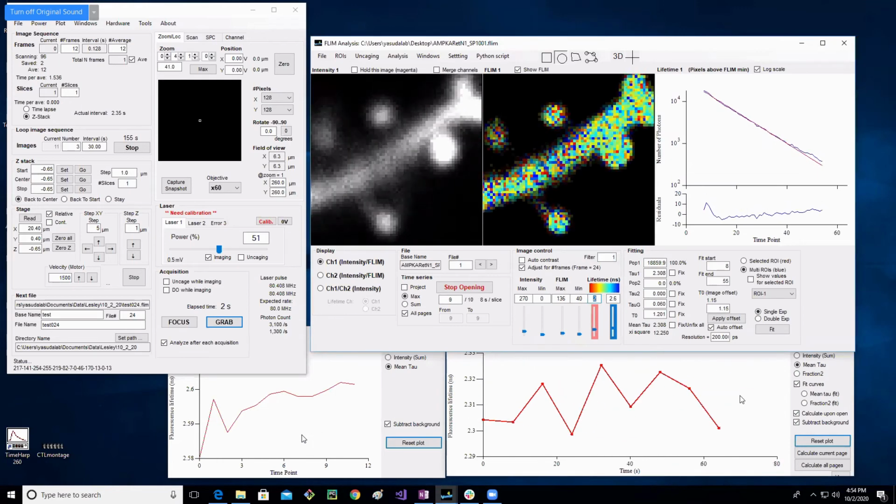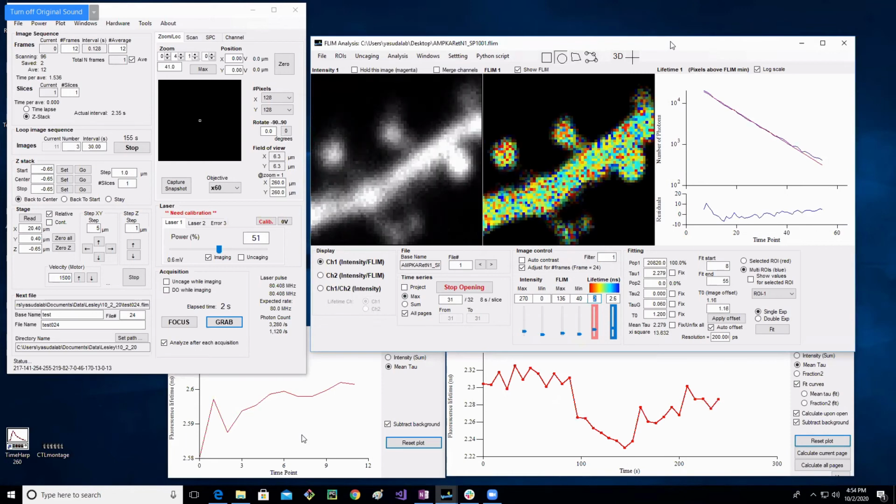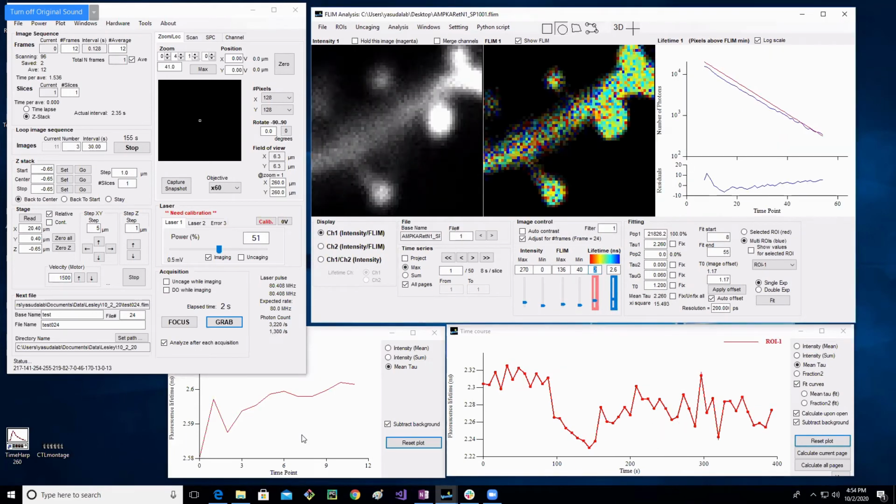Okay, I'm going to open up the data set right here. You can see that when it opened, it did a quick analysis. This is data that I took a little while ago. It has a sensor in it, and I can just go through quickly how I would analyze something like this. This is a data set using slice imaging. You can see it's one single file, and it has a time series of 50 images at 8 seconds per slice.